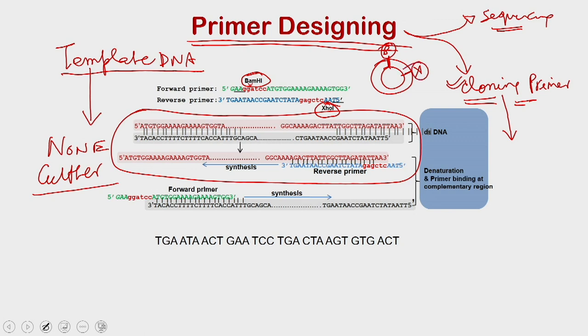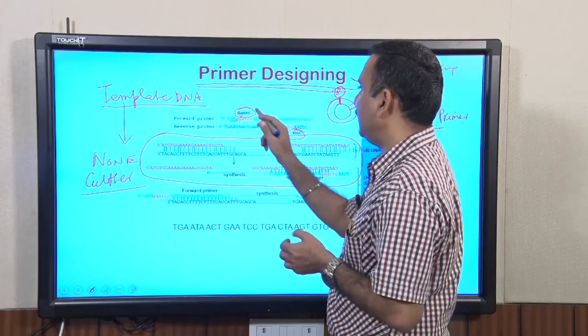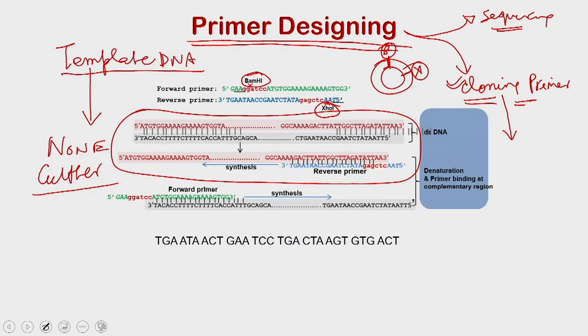All this we are going to discuss when we discuss the plasmids. So, for now, what we have done is we have taken BamHI in the forward primer.